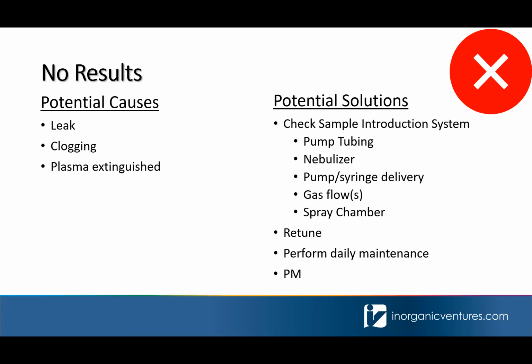Some of these can be a bit of a black box, per se. If you don't know what's going on, we recommend you contact the instrument manufacturer to figure out what's going on, or that you don't use any of those sort of corrections. Most users tend to be afraid of raw data and spectra for some reason, but we think this is really good information to use when troubleshooting a problem with your ICP. So don't be afraid to get into those spectral windows, look at the raw data, and try to figure out what's going on.